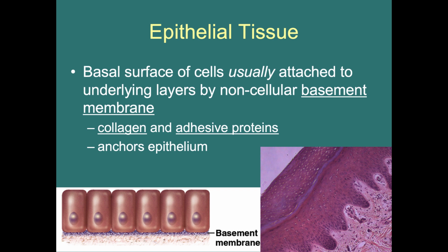Over on the right, we can see this distinct difference between the cells on the left and the cells on the right. And I'm tracing over where our basement membrane would be. And to the left, we can see our epithelial tissue, and to the right, we can see our connective tissue.